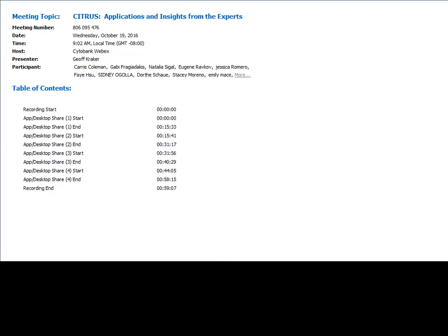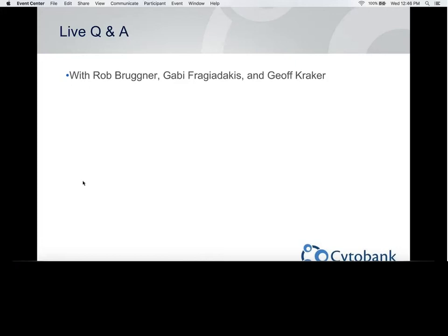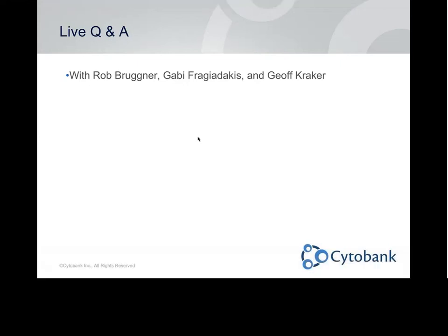With respect to that first challenge in terms of limitation on biomarkers, about the time that I started my graduate work and joined Gary Nolan's lab, we started working with one of the first mass cytometers to perform actual biological and clinical research. And this machine could measure 40, 50 parameters at the same time, and it quickly became clear that with the data this machine was capable of measuring, we could collect far more markers and detect far more populations than we could ever hope to evaluate using standard, manual gating techniques. So that kind of took care of that first problem of measuring a limited number of populations.